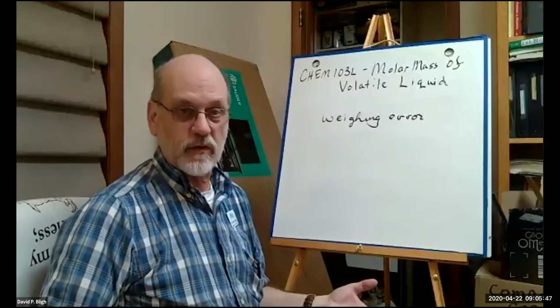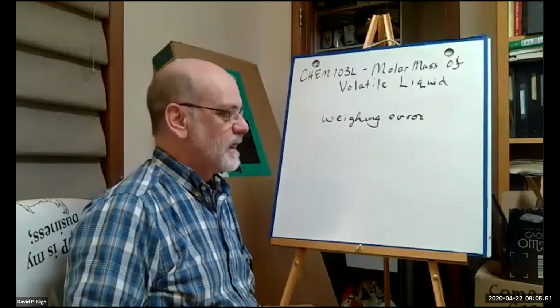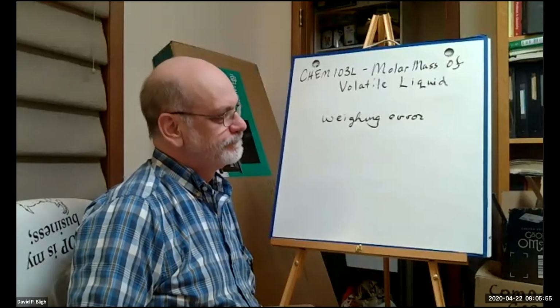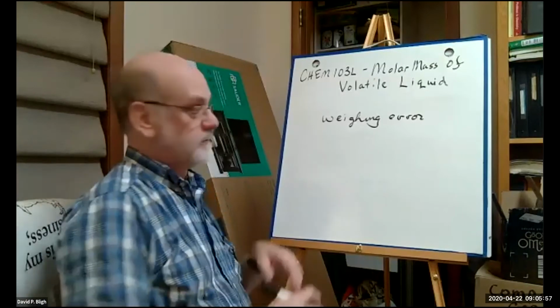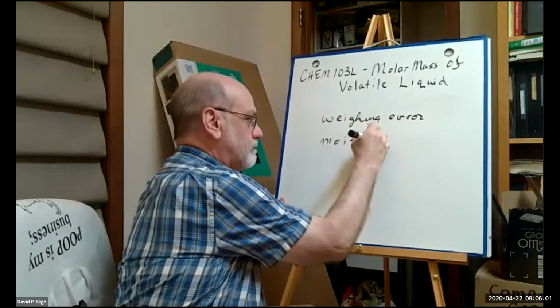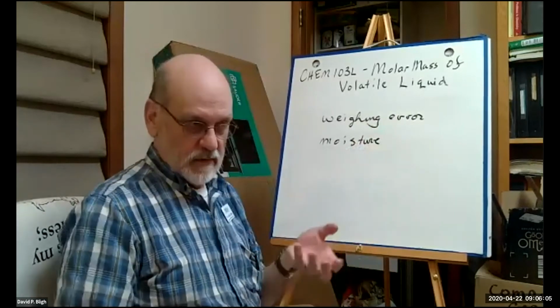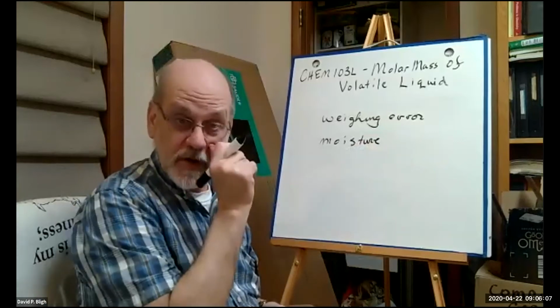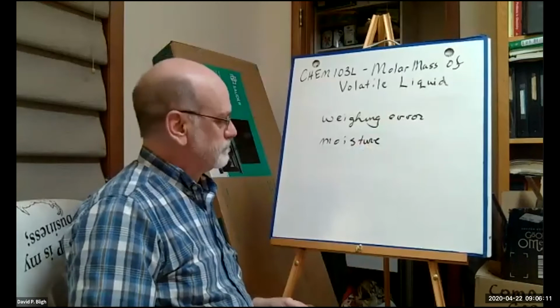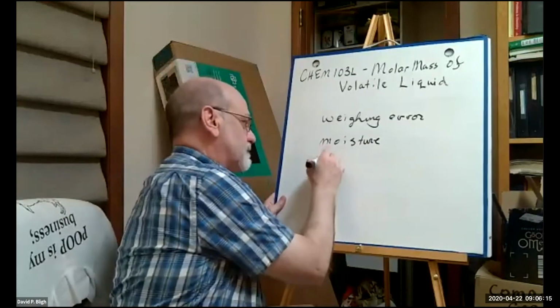You won't get an accurate weight until it's room temperature. We talked about one earlier: you could have moisture collected under the aluminum cover. That would be a problem. Temperature.